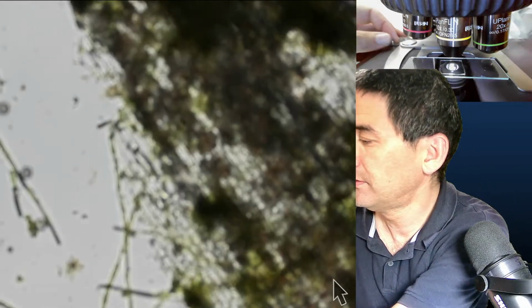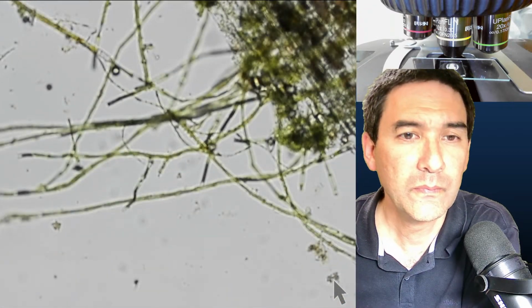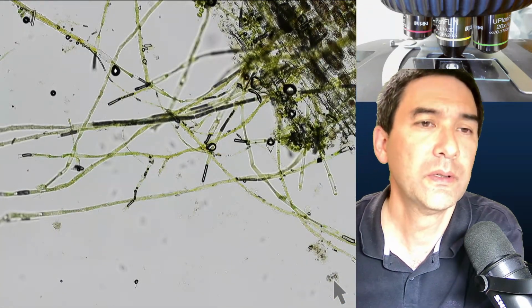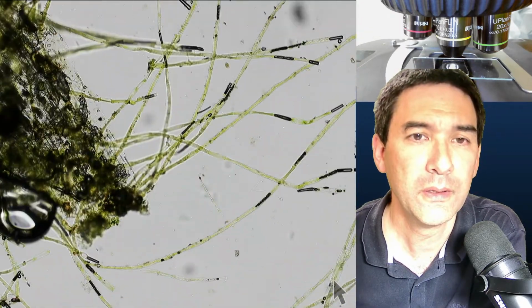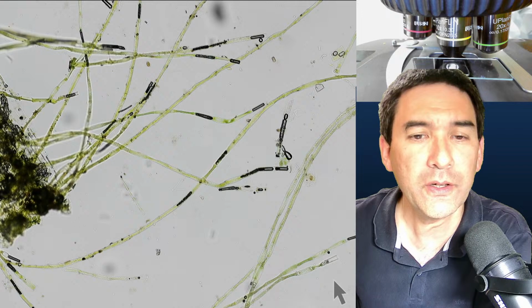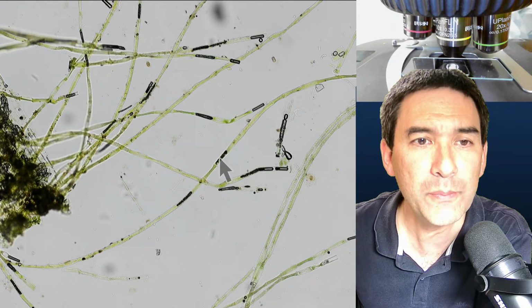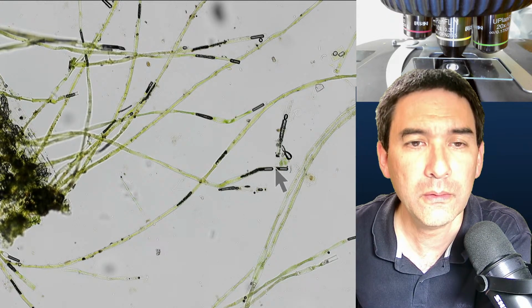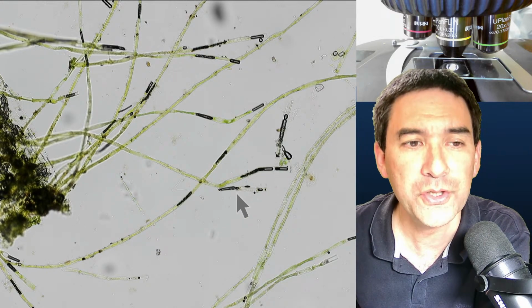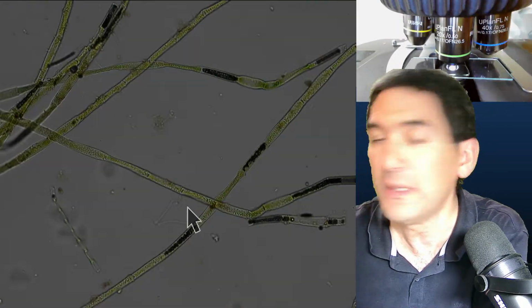Wrong scope. And here they are. Yeah, it's a little bit better maybe. Those, by the way, those dark things that you see here, these are air bubbles which appear to be inside the cells. And the air bubbles are quite visible because of the big difference in refractive index to the surrounding medium.